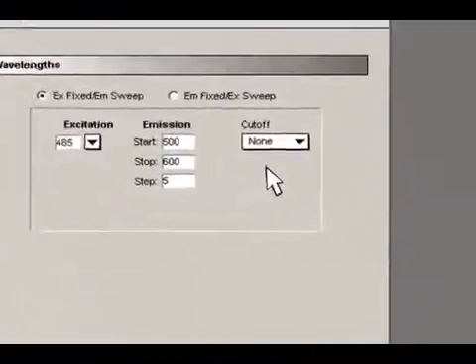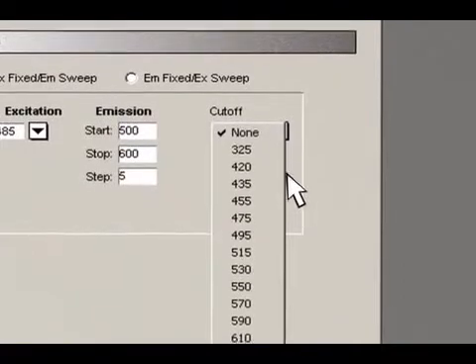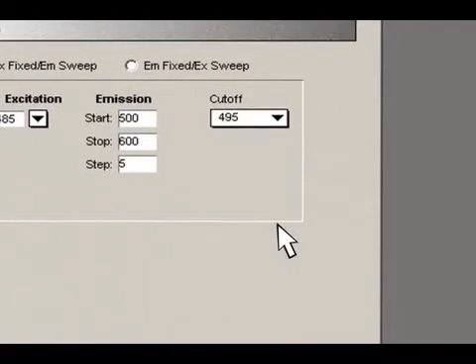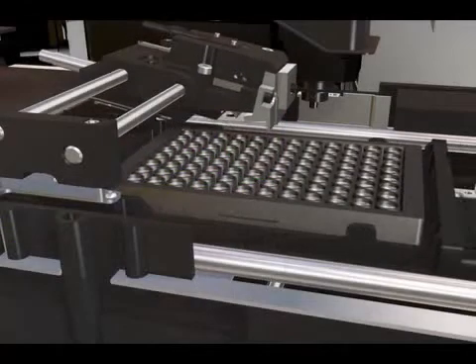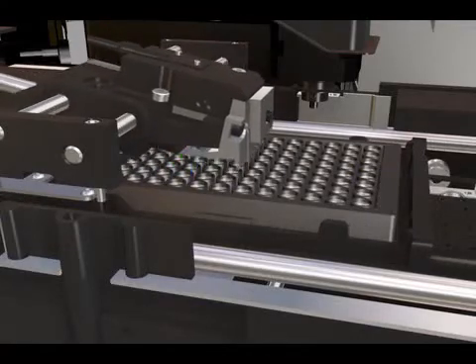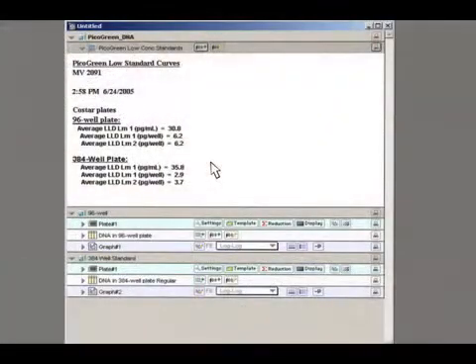Lastly, we can select an appropriate emission cutoff filter to eliminate any stray excitation light. We can now read our plate with our proper settings. Once the plate is read, the data is processed in SoftMax Pro.